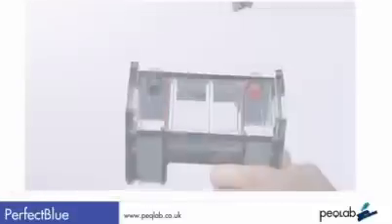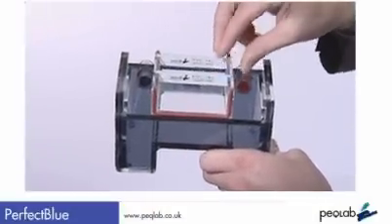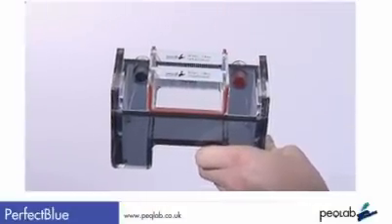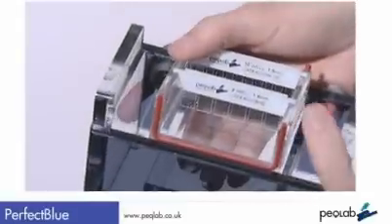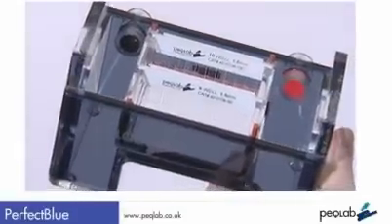The Mini S, M and L systems offer gel casting right in the tank, simply by rotating the tray 90 degrees. A number of accessories are on offer to assist pouring multiple gels at the same time.